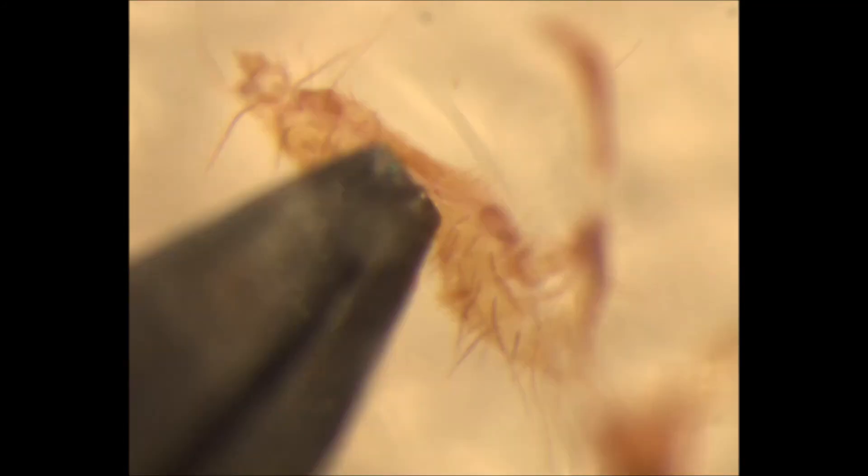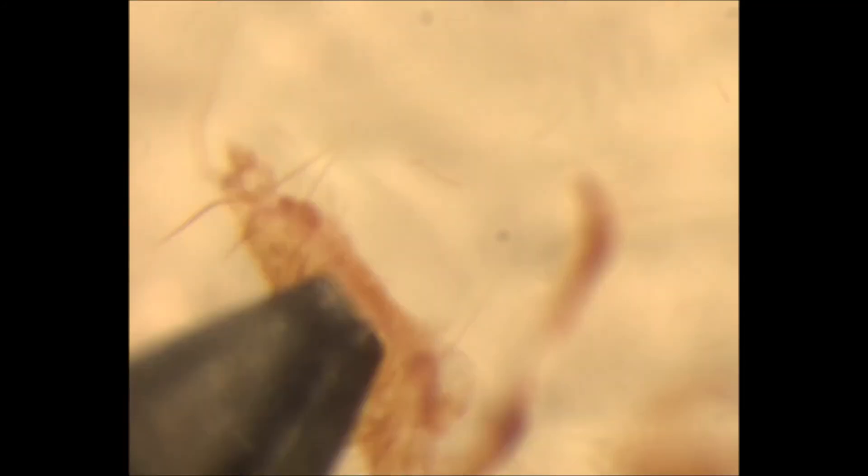I can separate the labrum from the head. There's the labrum and epipharynx by itself. How about the mandibles? The antennae? I don't want to lose that epipharynx up here.